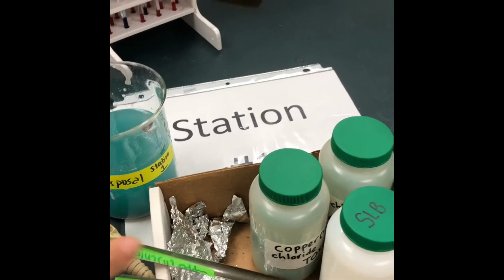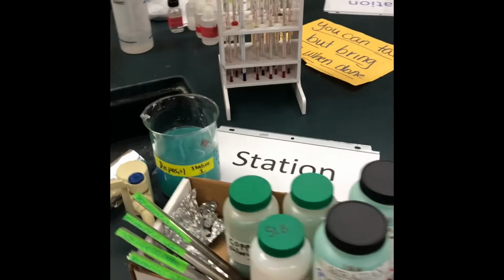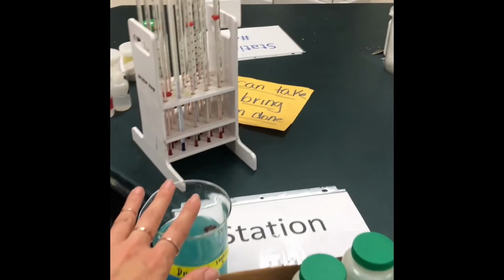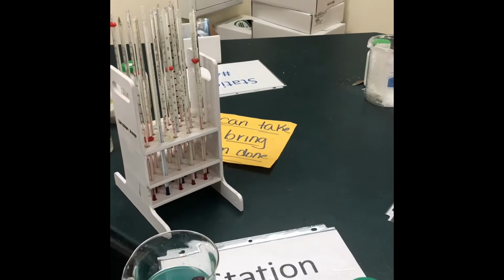So don't use your own spatula. And if you remember, your own spatula is in your common drawer, seen here. You're going to need your own spatula for the other parts, so keep your clean spatula for the other stations. Okay, so back to station 1. You're also going to need some aluminum foil. Please make sure you read the procedure, but the disposal is extremely important. There are specific disposal beakers for some of the stations. Again, read your lab so you know, but don't cross-contaminate the disposal, okay?